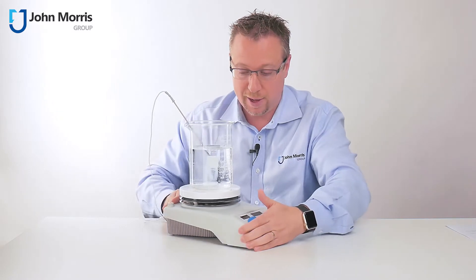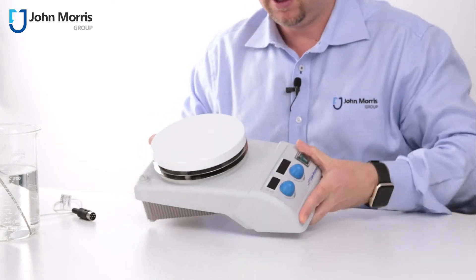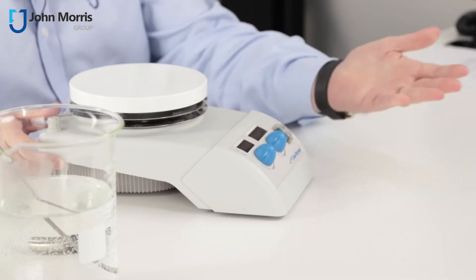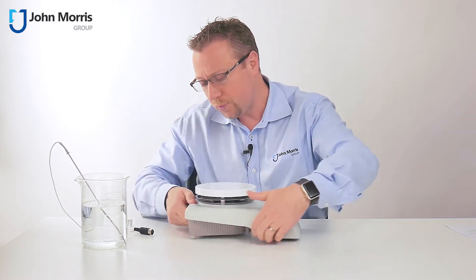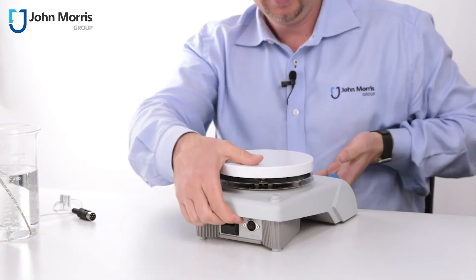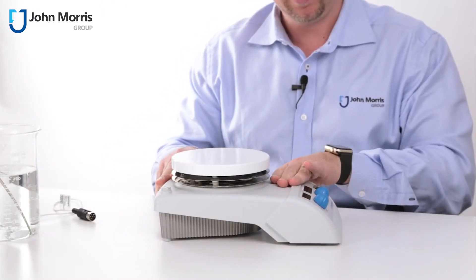Another thing I really like about this hotplate magnetic stirrer is this raised lip. This raised lip is really important because it's quite possible to have spills on top of your hotplate magnetic stirrer, and when fluids spill, you want them to run away from the controls on the front. The controls are covered, so you shouldn't have any concerns about getting liquids in there unless you literally deluge this unit. The power at the back is recessed underneath the lip, so if you spill fluids over this unit, you don't have to worry about shocks. There are also nice rubber feet on the bottom, meaning you're insulated and standing up out of any fluids that might spill on your bench.